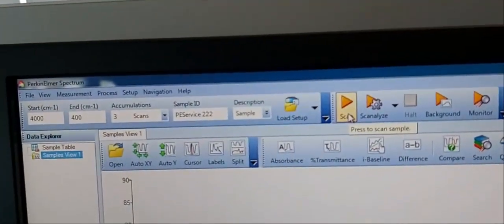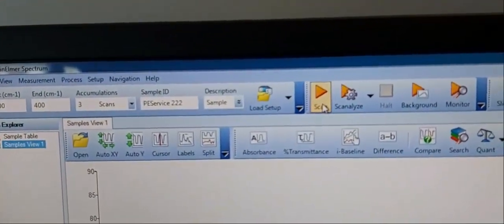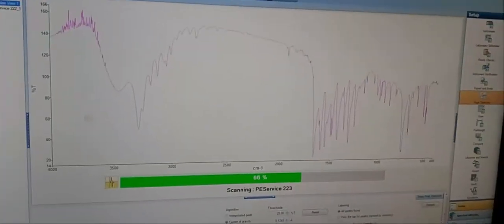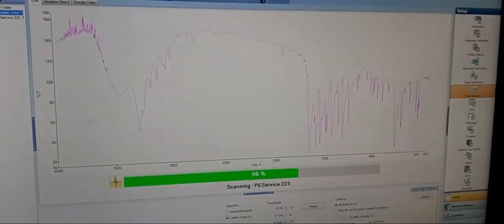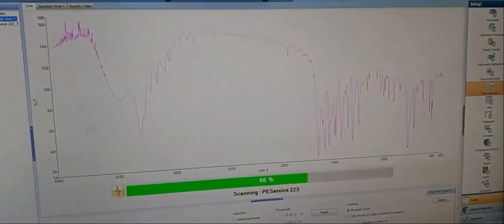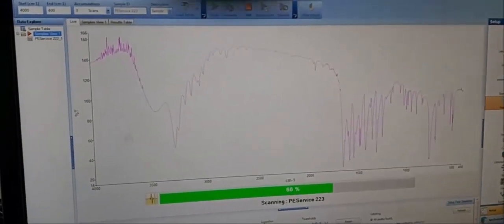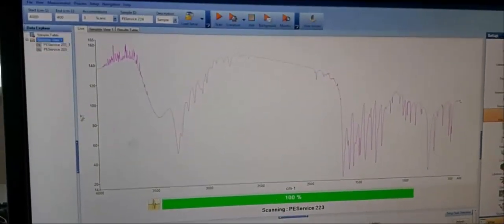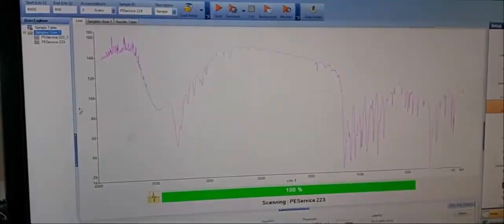We go to the software and click Scan. In a few seconds the spectrum appears. With that, we finish our experiment. Thank you very much.